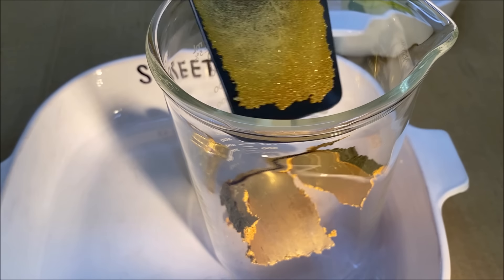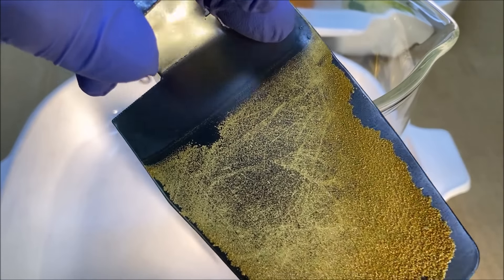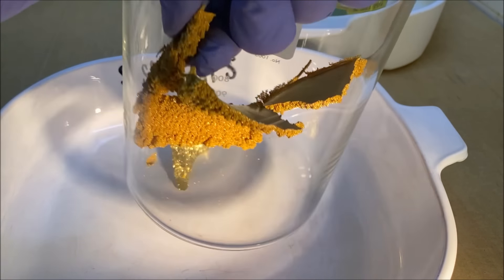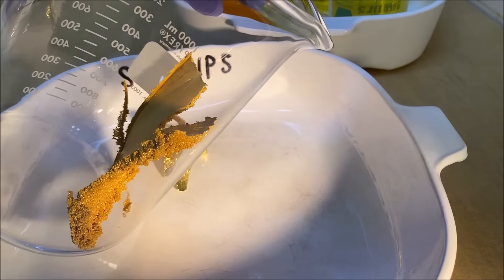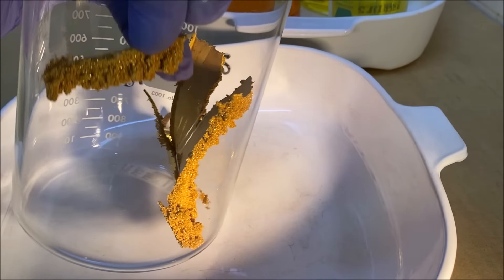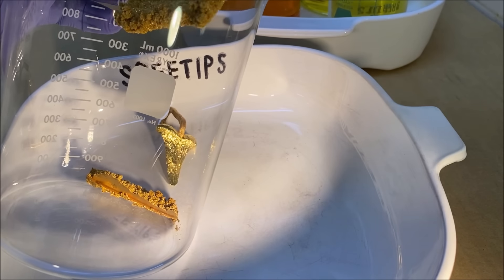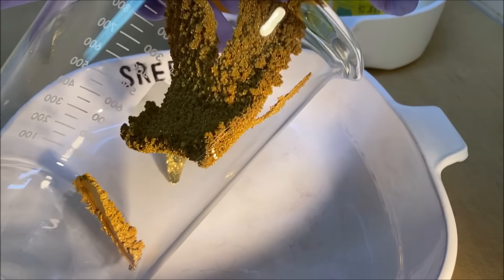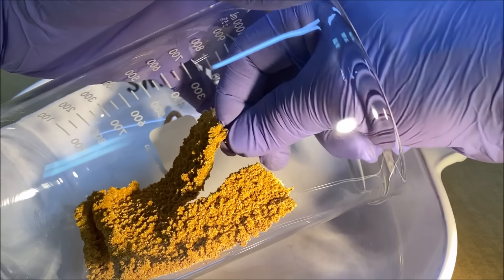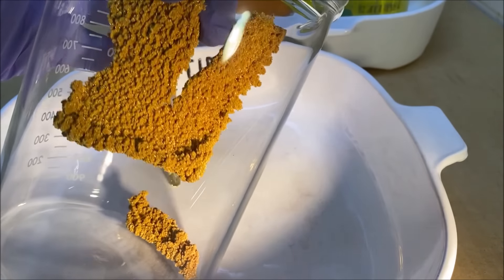There it goes — got most of it to release. There's still a little bit on the back, we'll deal with that later. Here's our pure gold. Here's our pure gold piece of it. I think what we're going to do is just leave it like it is, maybe break off some chunks and offer a few pieces for sale on my eBay site.